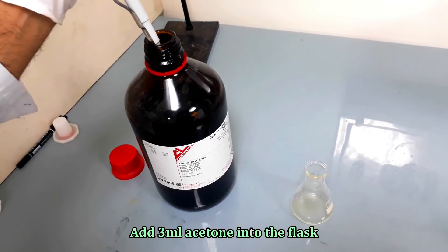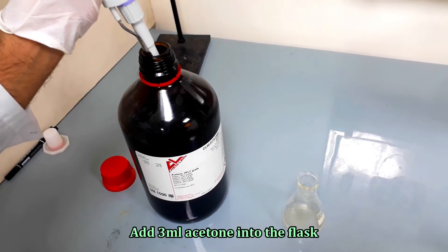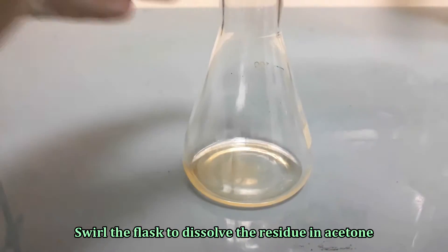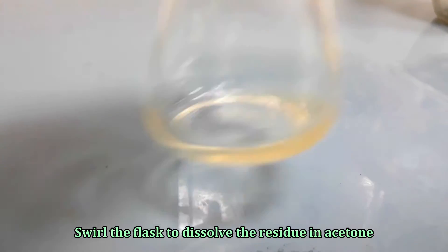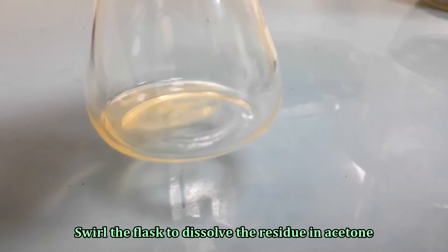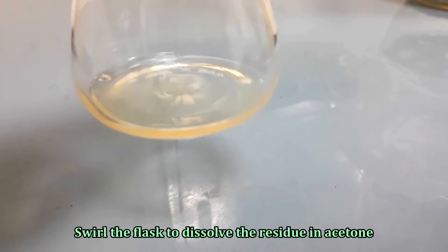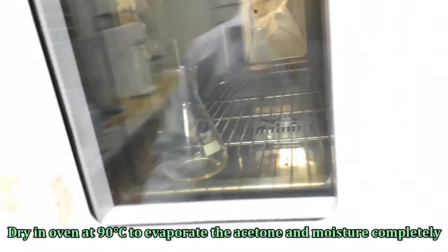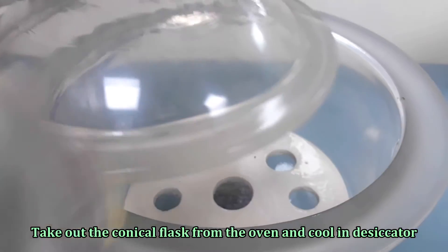Now add 3 ml acetone to the flask. Rotate and shake the flask to dissolve the residue in acetone. Dry the flask at 90 degrees Celsius in the oven to evaporate the acetone and moisture. Cool the flask in a desiccator.